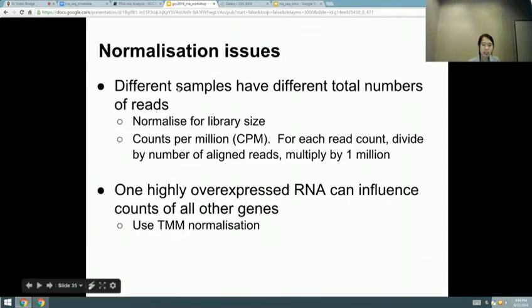So this is normalization. This will all be done within the DESeq2 tool. Someone's already written the steps on how to do it. It's normalized by library size, and Cuffdiff also normalizes by gene length. Here we're just looking at library size because we're comparing within genes, and gene length won't matter if we're doing apples to apples comparisons.